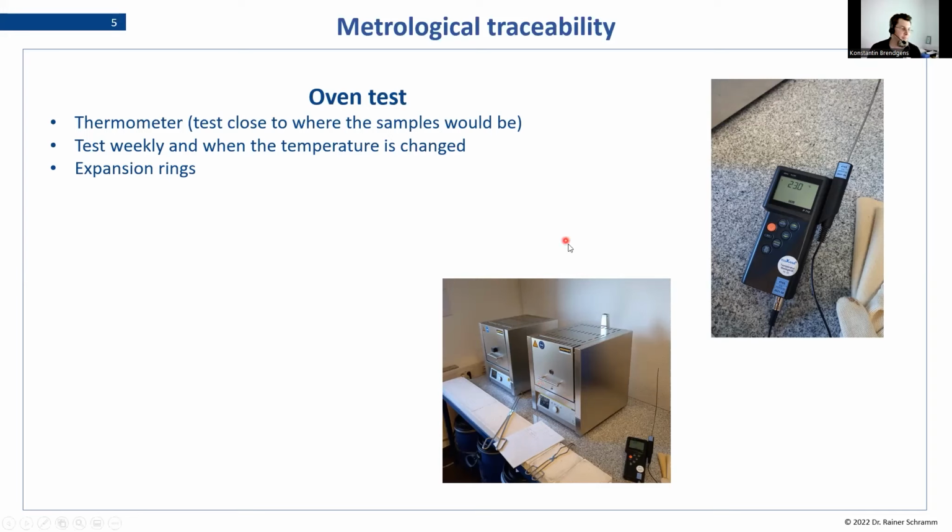The way FLUXANA handles this is with testing ourselves. We have two thermometers which have been calibrated externally. These ones we send away and they come back with, again, a proof of certificates and so on. So you can do it either way. You can have them checked inside or outside.